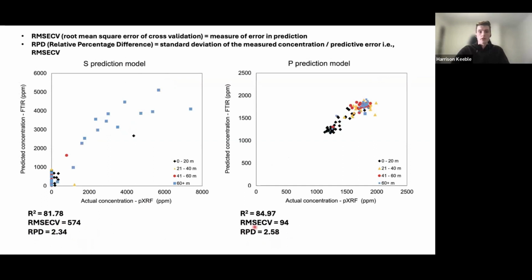We did models for pretty much a full suite of elements, but you can see some of the models are limited. They do have reasonable R-squares and RPD values. However, some of these models lacked sample numbers. You can see here, the majority of them had 0 concentration, and the ones, particularly in the sulfur, are mostly deeper down, which would probably be remnant pyrite.